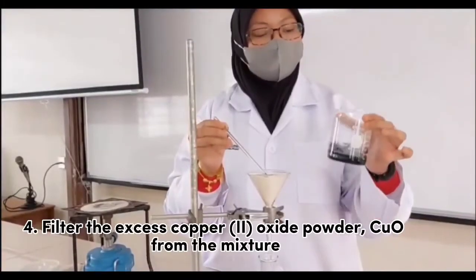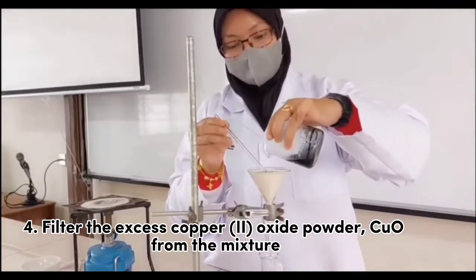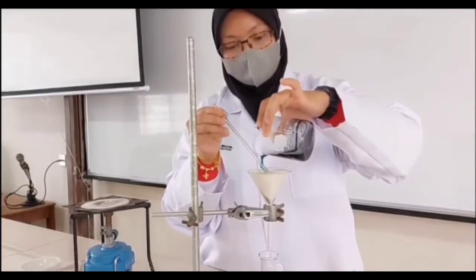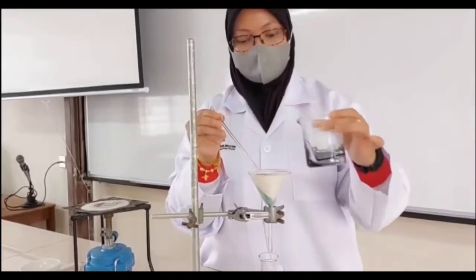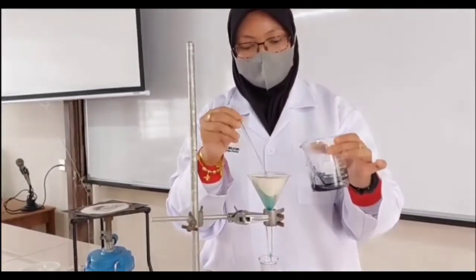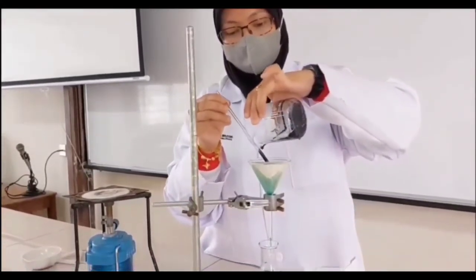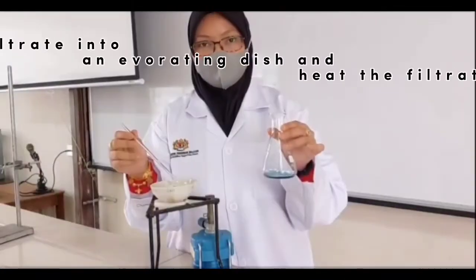Step 4. Filter the excess copper 2 oxide powder from the mixture. Step 5.